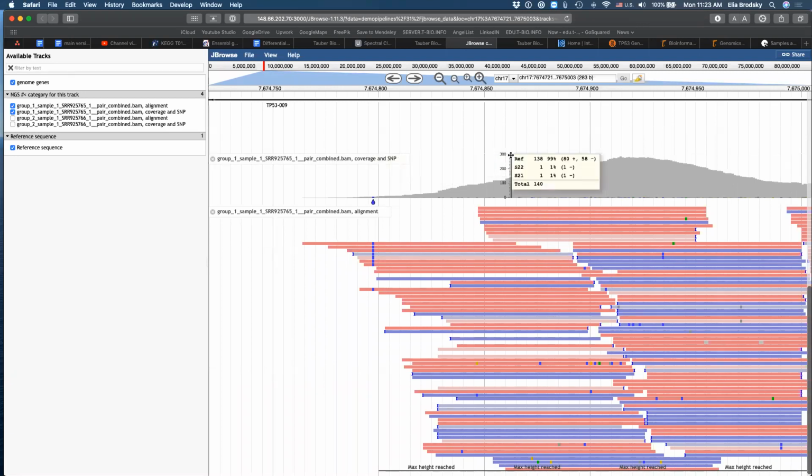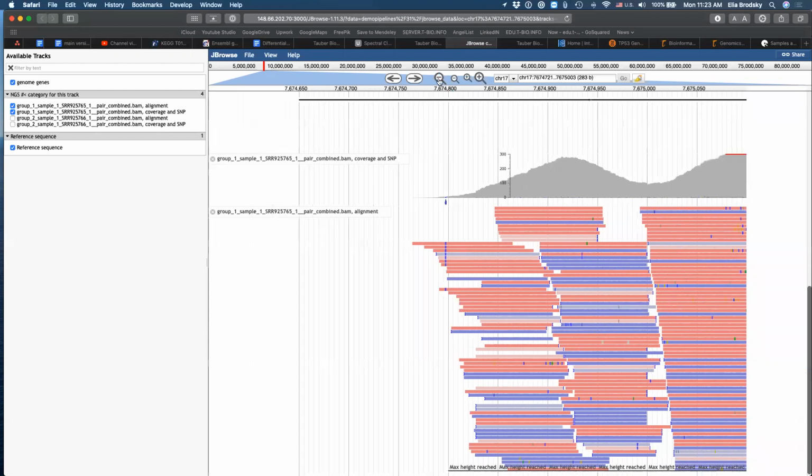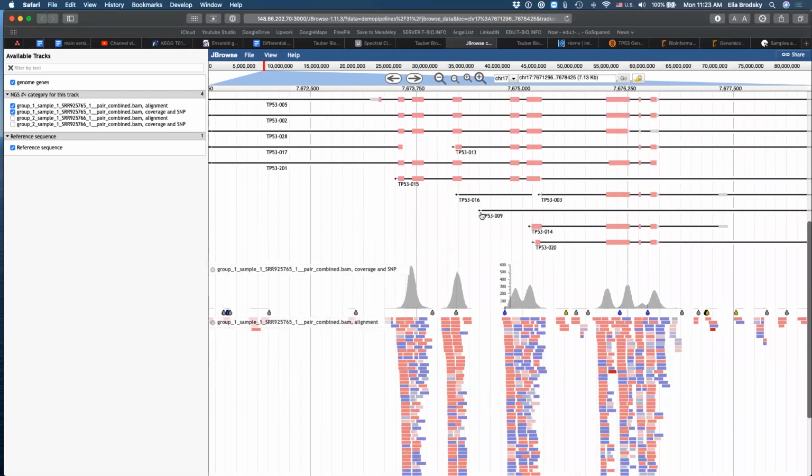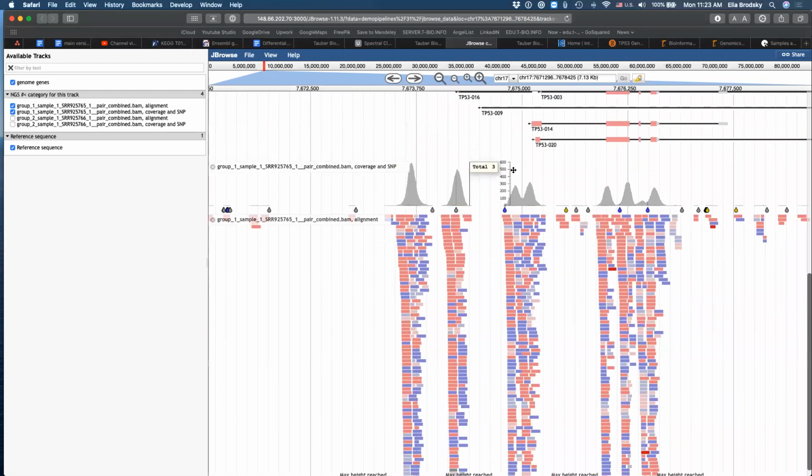However, look at my total alignment here. The y-axis shows us the height. This is the alignment. Exactly, this is the frequency that we need to now determine, and we will talk about that in a second. So if we go back and zoom back out, one of the questions is, what is an average alignment across the whole sequence that we are studying?